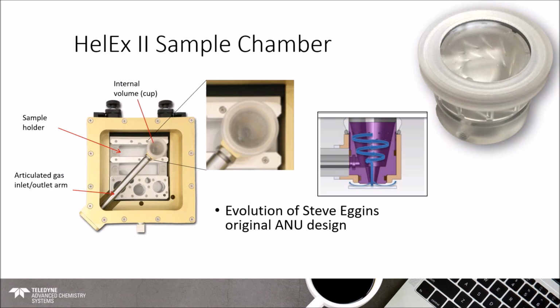the analytical plume comes up and is kind of pushed up by a flow within this outer sample chamber that meets a flow that's pushing down from the top of the cup. That's what's illustrated on this picture on the right, is these 2 flows kind of coming together to push that plume into the sample arm, which leads directly to the ICP-MS torch.